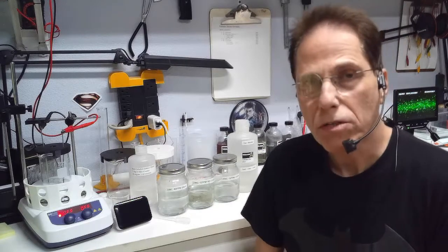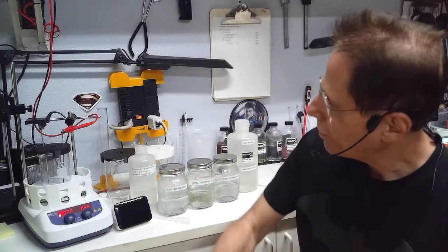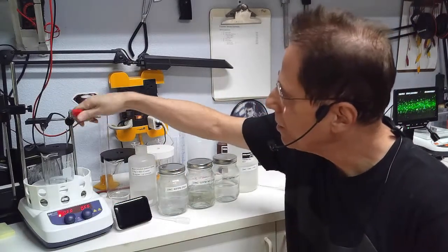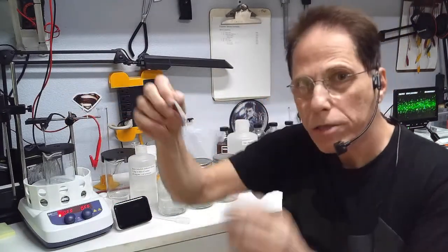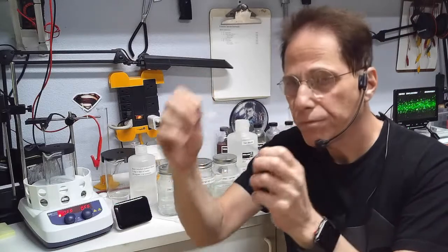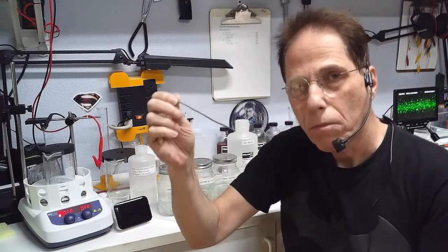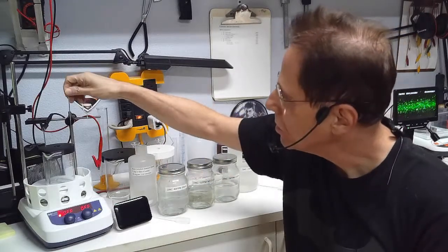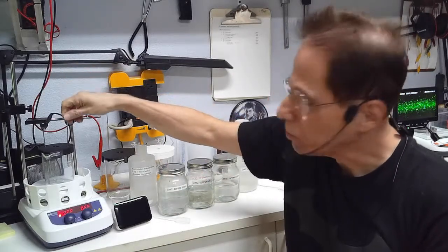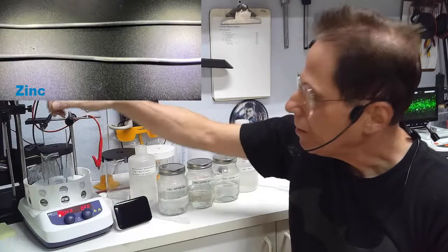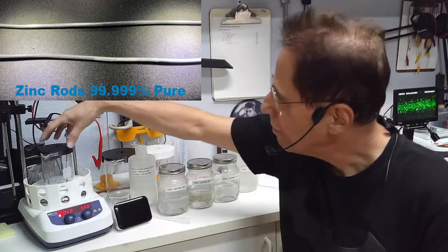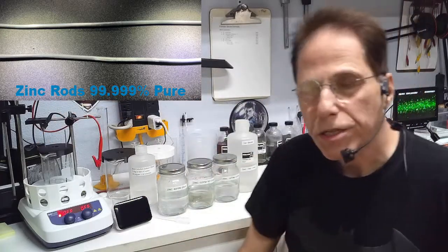Basics of making colloidal zinc: you are going to need zinc rods, two of them, 99.99% zinc rods. You can get them on Amazon, at least that's where I got mine. They will last a long time and zinc isn't too expensive.